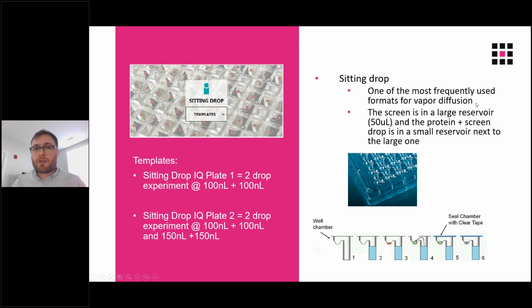Using the vapor diffusion effect at the heart of a lot of crystallography, at the heart of hanging drop and sitting drop, we are able to grow the crystal in this subwell here and keep the environment stabilized by having access to the well condition here. So in the Mosquito, if you go under the sitting drop templates, we have an example template experiment where you set one total drop with 2 drops of 100 nanoliters of protein and 100 nanoliters of condition inside each of these subwells.